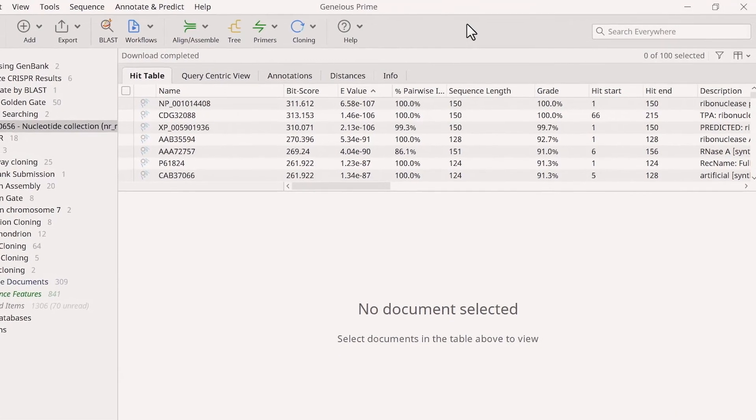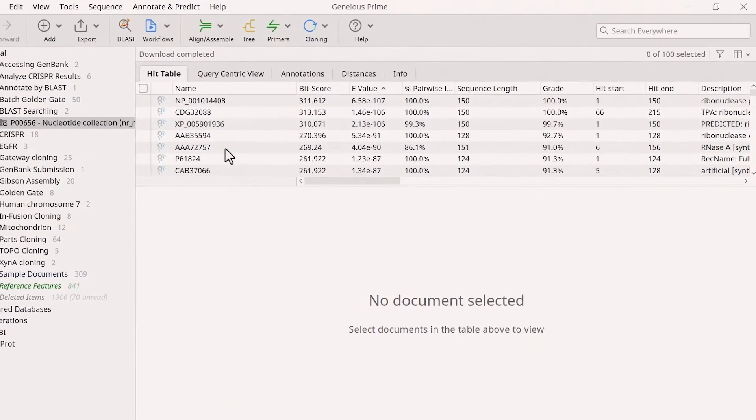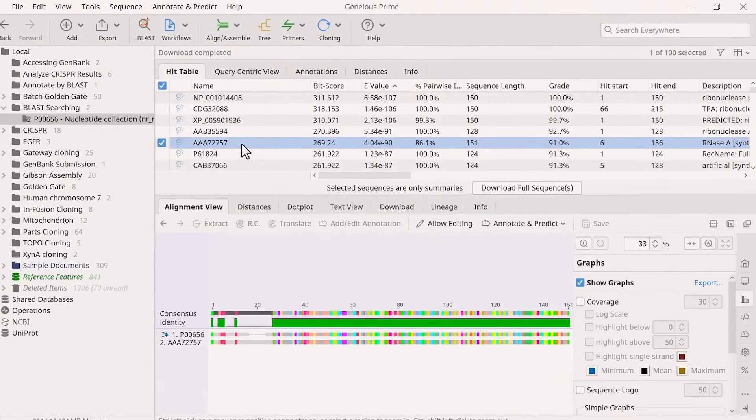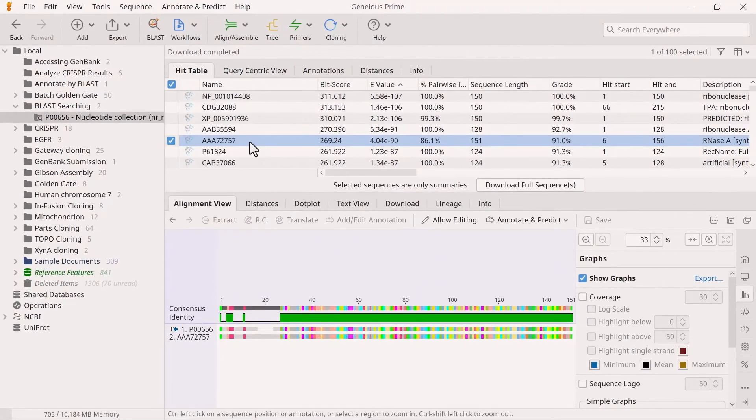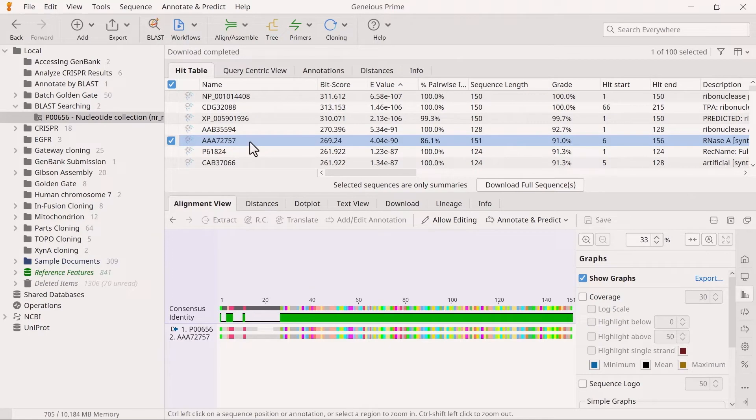Select a hit in the table to view it in more detail. This will open the alignment view below, which compares the query sequence to the hit.